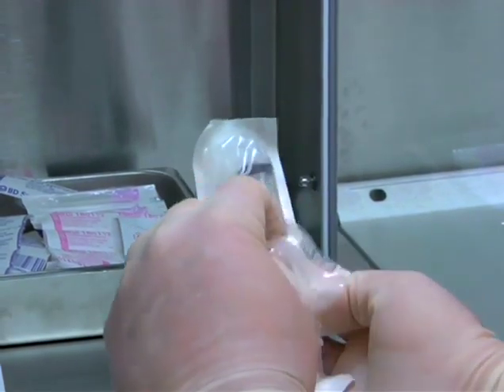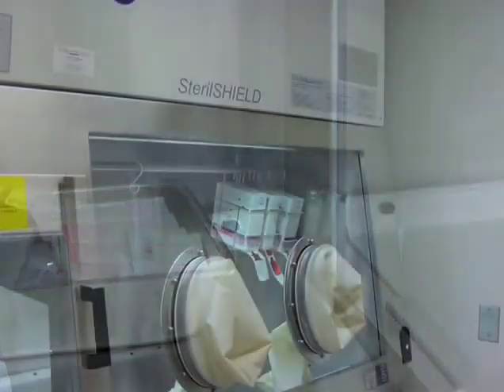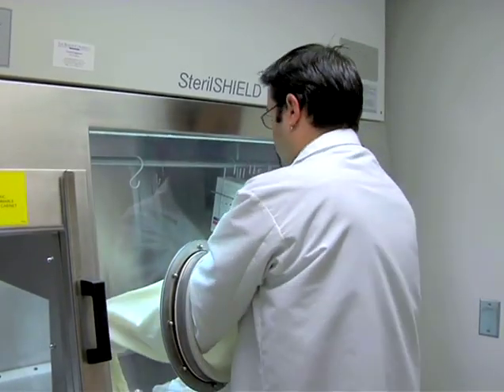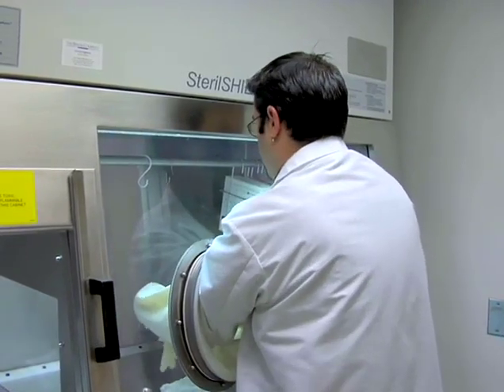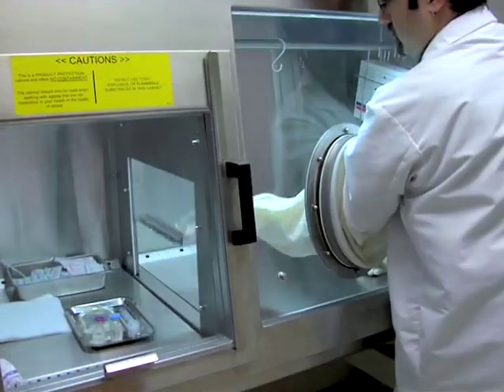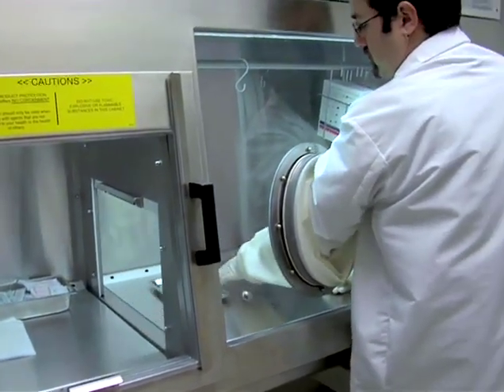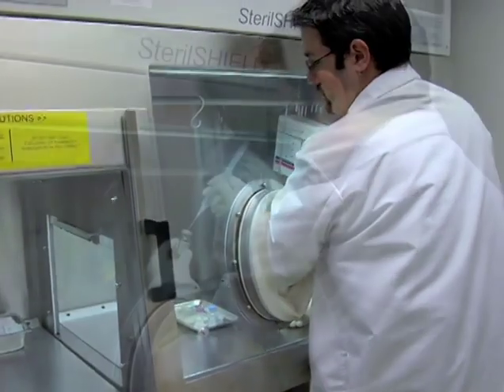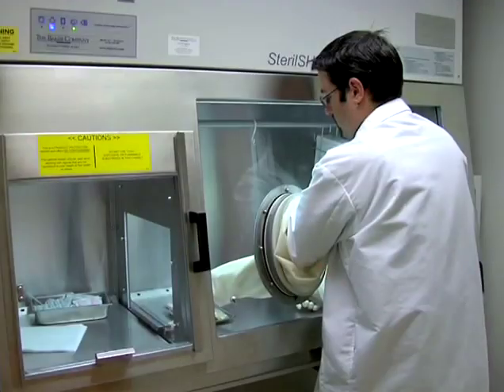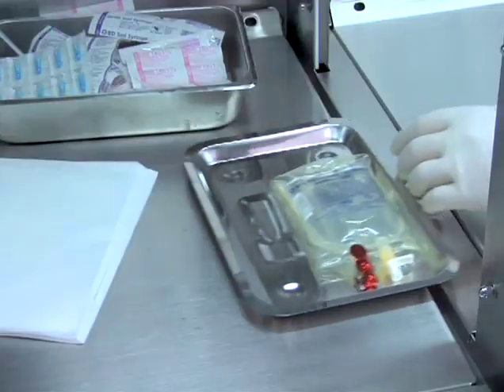It is important to remember that numerous contaminants may easily be introduced into the CAI along with non-sterile supplies. These contaminants may become more difficult to eliminate due to the relative inaccessibility of the CAI's core interior and the resulting difficulty in properly cleaning this design. Also, if flawless containment technique is not followed in the CACI, the hazardous drugs manipulated may contaminate the outer surfaces of final containers and ultimately be transferred to the environment.